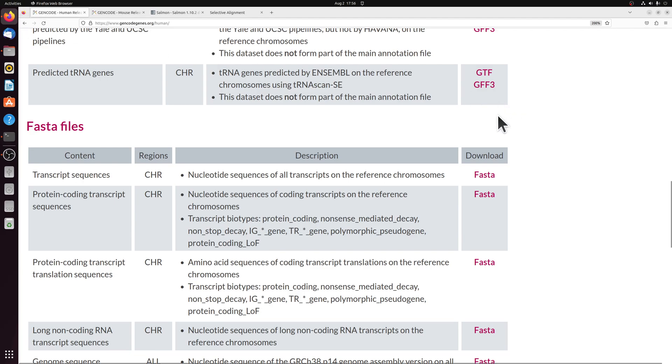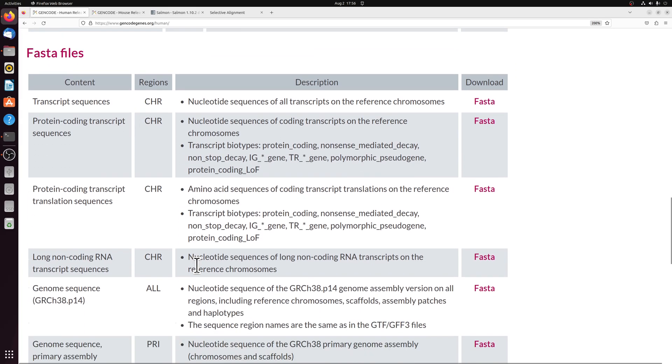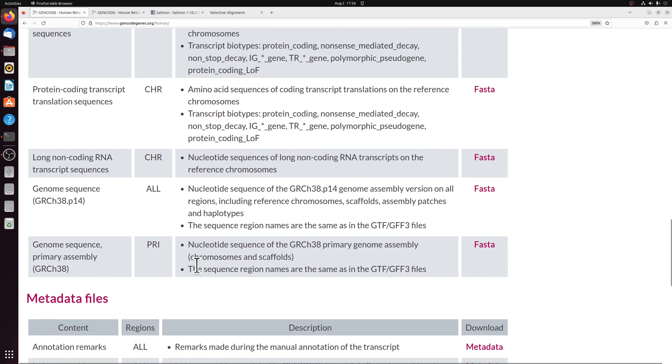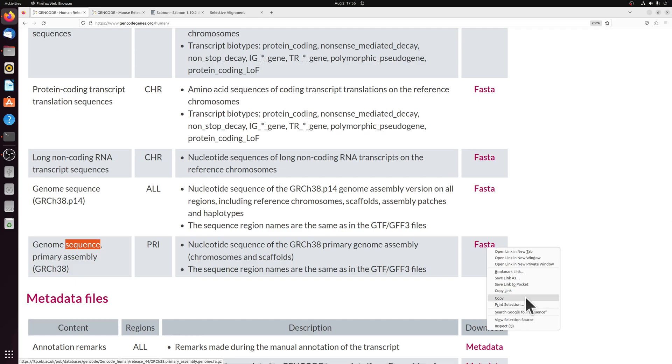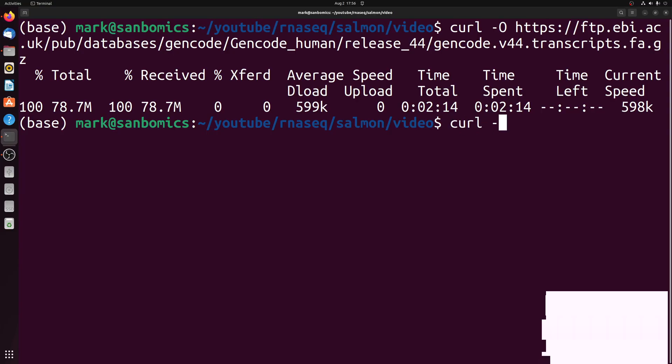So we're going to go back over to GenCode, and still in the FASTA files, we're going to scroll down to the genome sequence, the primary assembly, and do the same thing. Copy the link and download it.